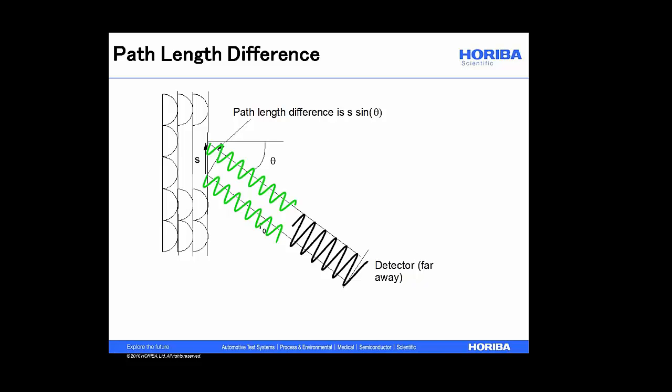Now if I put my detector in a somewhat different spot and I add these two fields, I will get a weaker intensity. So depending on where I have my detector, I will get different intensities for scattering from these two points. And you can start adding this up over all the points in your particle.